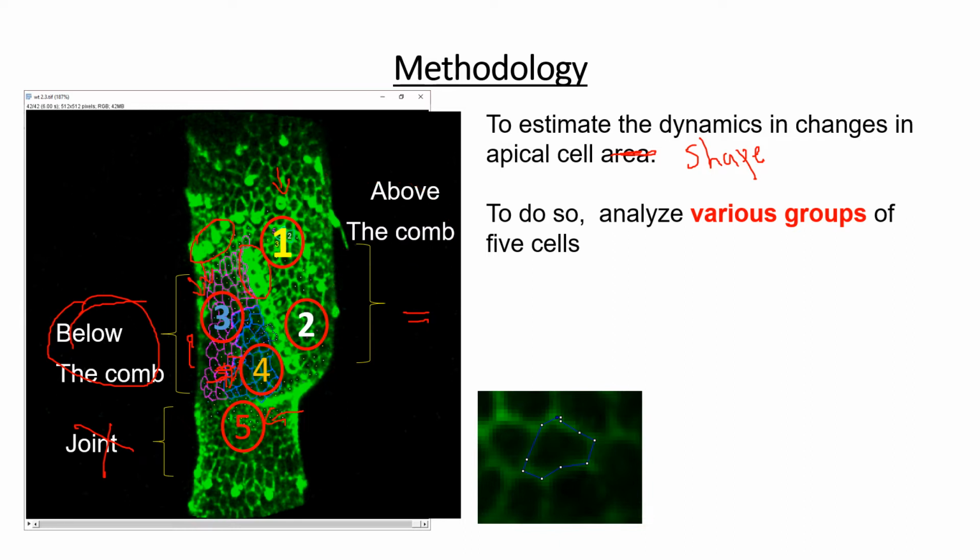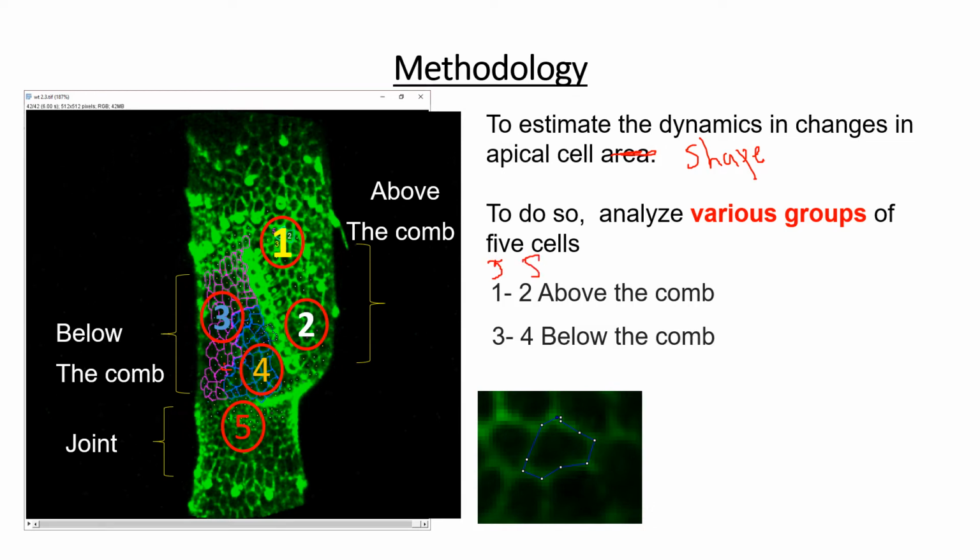Okay, so let me delete this. So we're going to study, as I said, 5 cells in each region, 5 cells here, and 5 cells here, and 5 cells here. And we are not going to study this one.